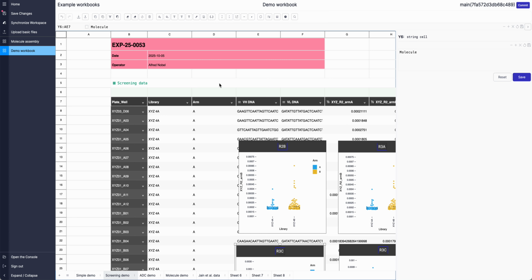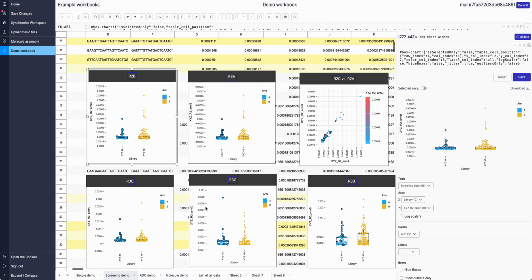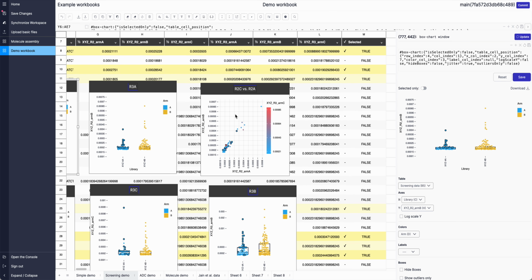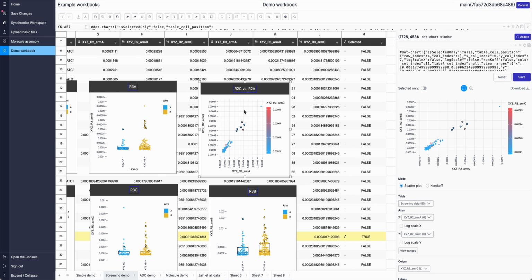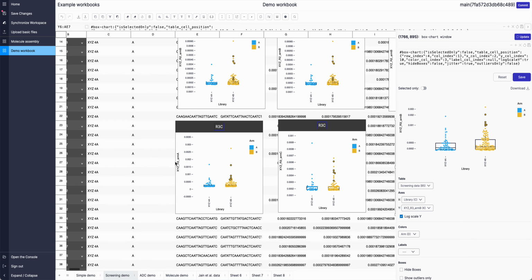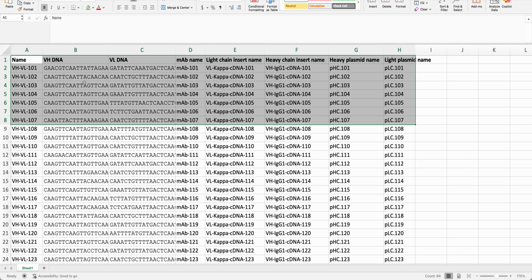Hi, so today we're going to focus not so much on the analysis part of things like assay data in the Bionamic platform, but rather on what to do once you've, for example, selected a number of hits from a campaign. So I'm actually going to start with an Excel file today.